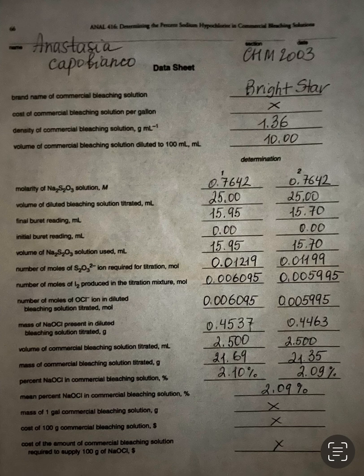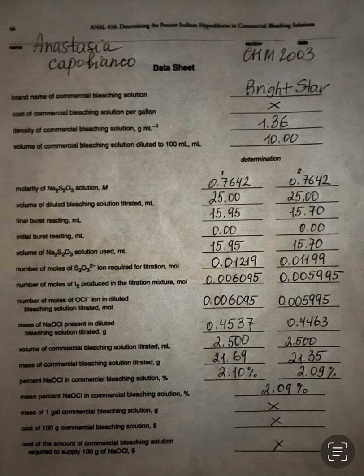For the number of moles of iodine, you can find equation number 4. As you can see, the number of moles of iodine produced equals the number of moles of thiosulfate ion multiplied by 1 mole of iodine and divided by 2 moles of thiosulfate ion. This is according to your stoichiometry and the chemical equation that was provided to you in the lab. Okay, so by knowing that, I found the number of moles for each determination.